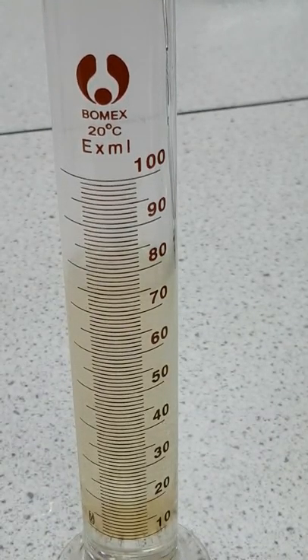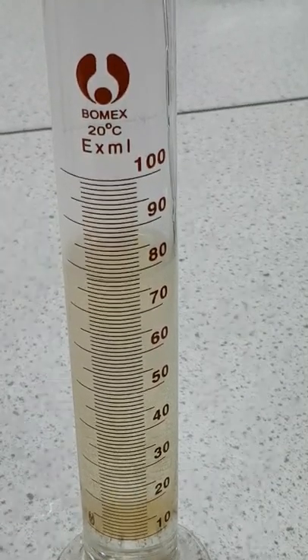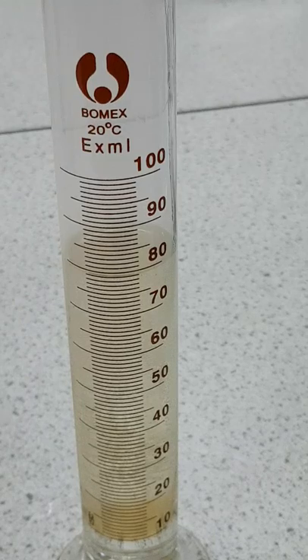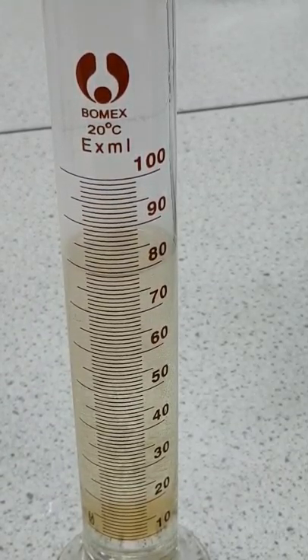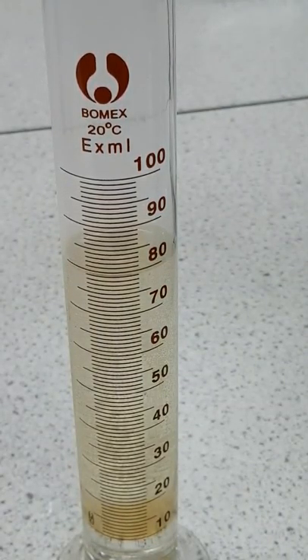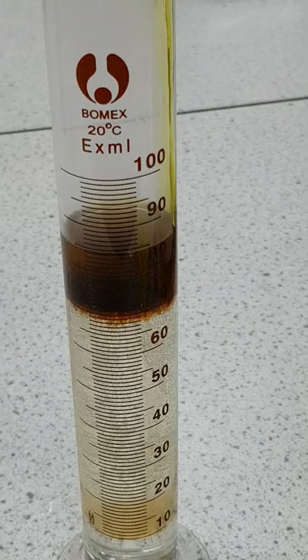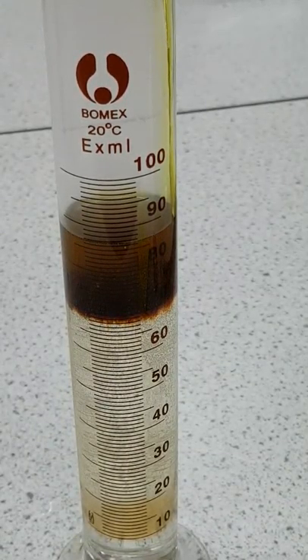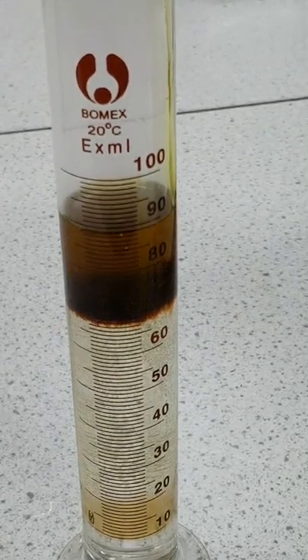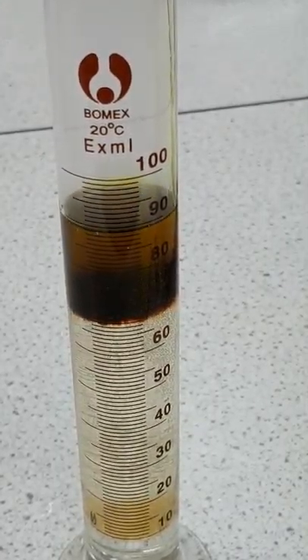Once that's in, our final layer is 10 centimetres cubed of 0.5 molar iron(III) chloride, which is deep yellow in colour and quite acidic. We put that in, and at the interface of the two layers you can see the formation of some dark brown iron hydroxide. Once it's settled we can remove the layering tool and give it a quick rinse.